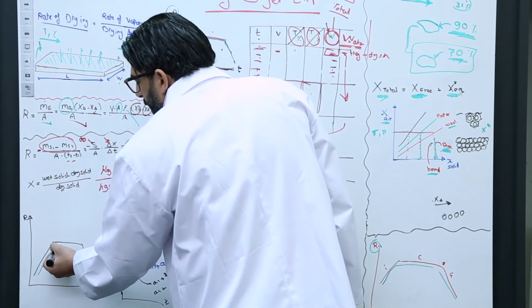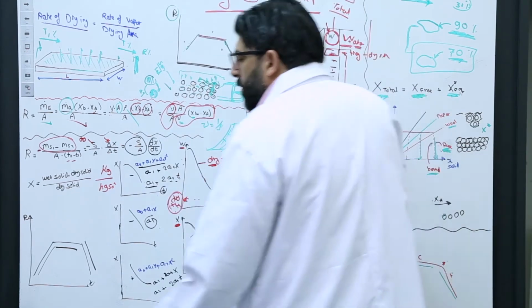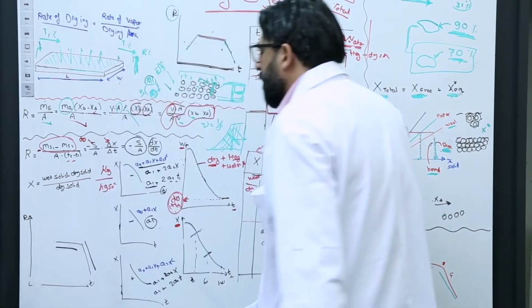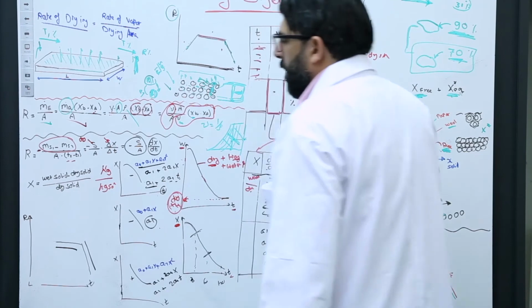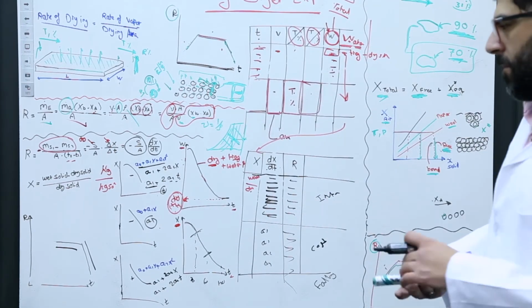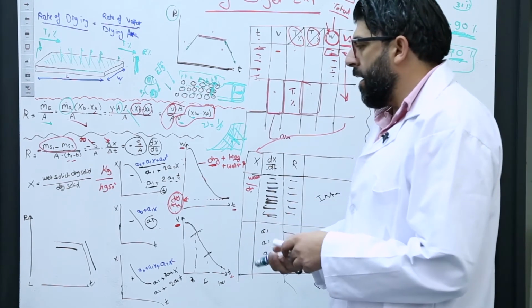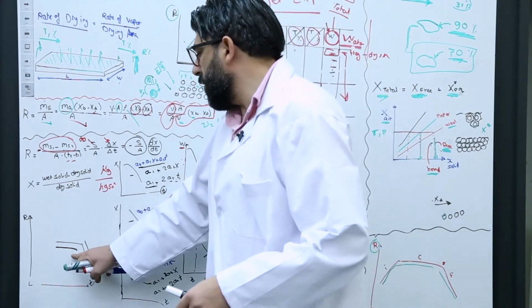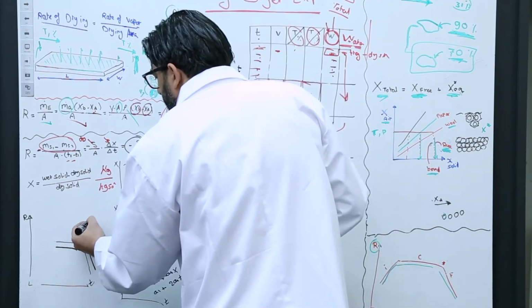So this is the initial, constant, falling. Sometimes you don't have initial, you only have constant and falling. So it's usual. You may have only constant and falling. Okay, if the tray dryer is already preheated well and you do not have too much water, you can start from constant to falling, and this point is critical.